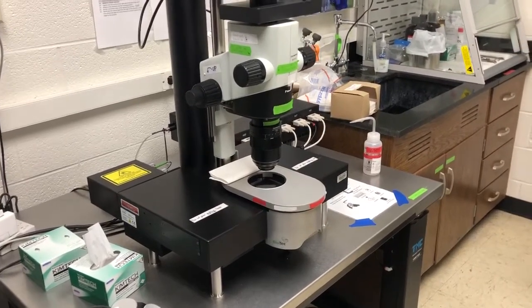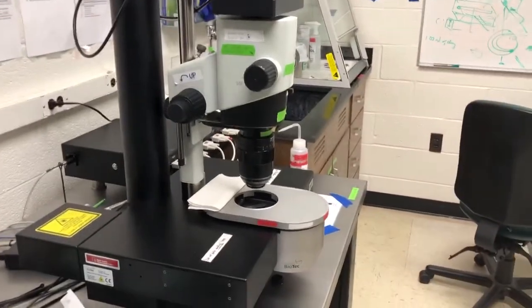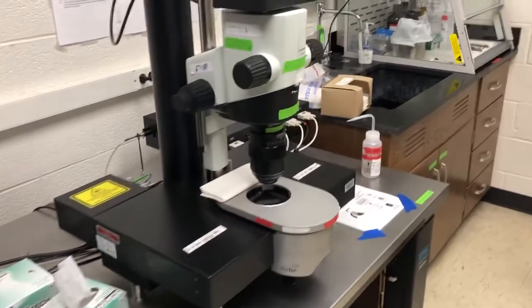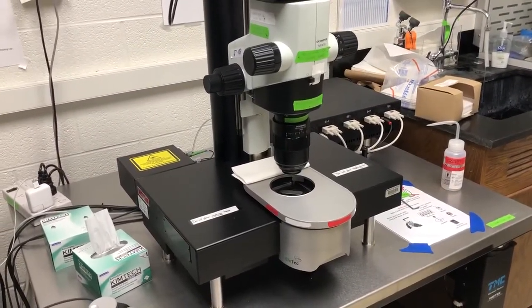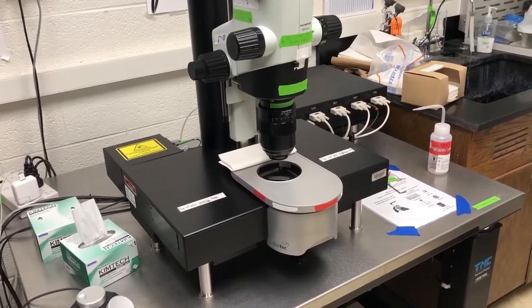Let's talk about some of the risks involved in using the system. There are two categories of risks you need to be aware of. The most important is your safety. We want to minimize risks to your own health, and the main source of risks to your health is the dibenzyl ether.